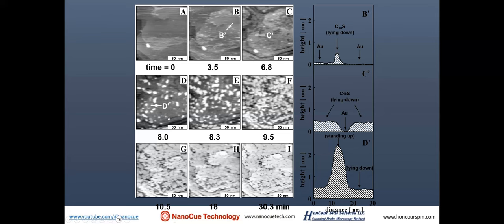At another time, 8 minutes, you can see a lot of white dots start to appear. These white dots are very tall, about 2.5 nanometers. That is consistent with the molecule that we put in when the molecules are standing up. So we're observing the molecule transition from lying down to standing up. This transition is, I think, the first time being observed using atomic force microscope in organic solvent. I published this one in 1997.